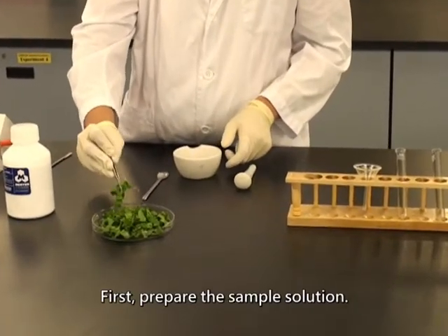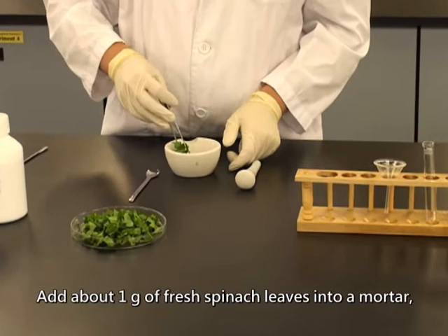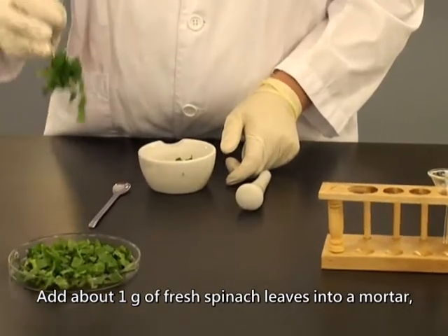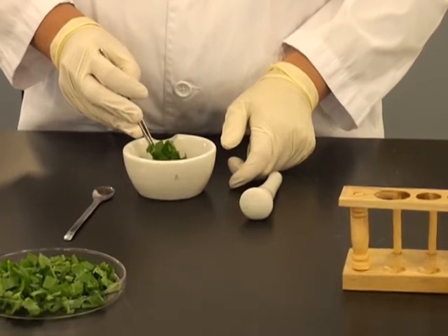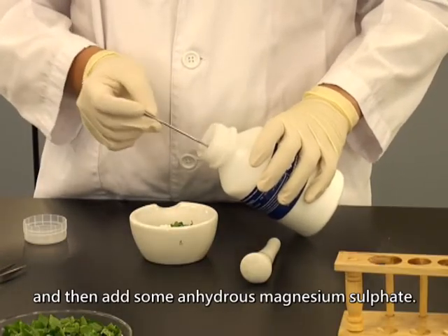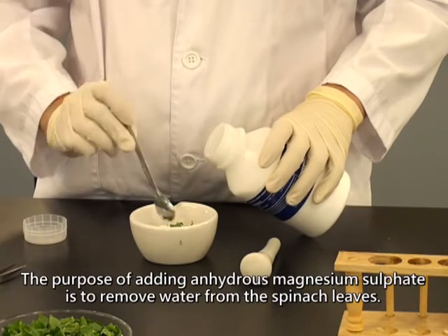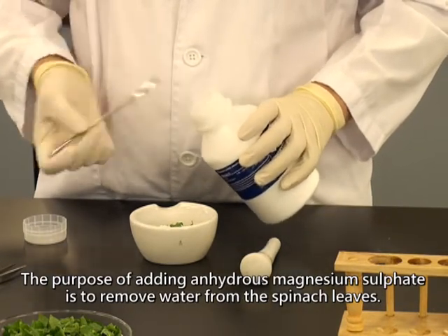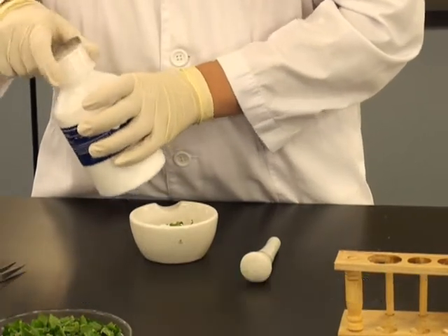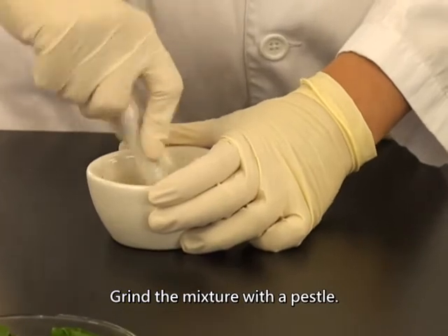First, prepare the sample solution. Add about 1 gram of fresh spinach leaves into a mortar, and then add some anhydrous magnesium sulfate. The purpose of adding anhydrous magnesium sulfate is to remove water from the spinach leaves. Grind the mixture with a pestle.